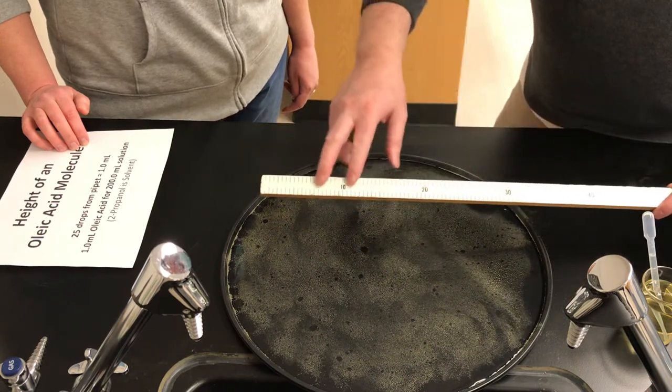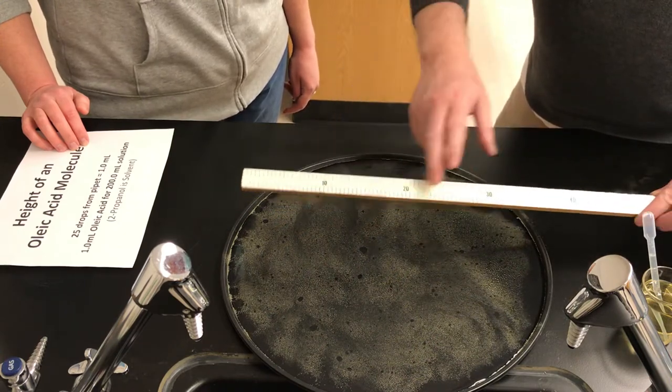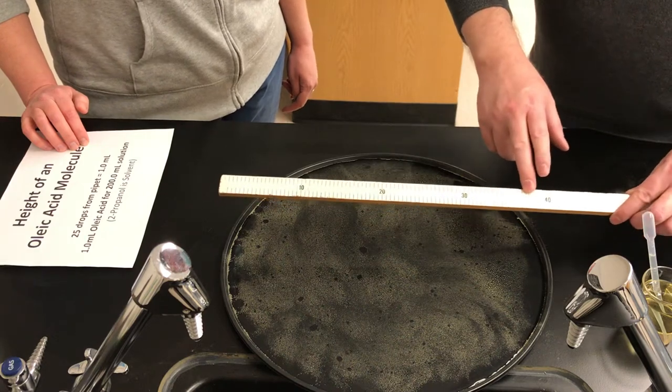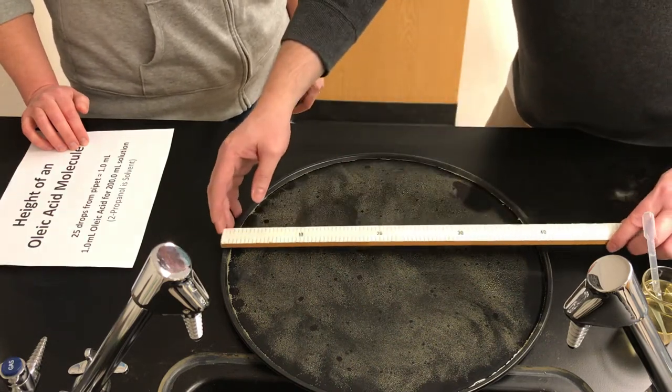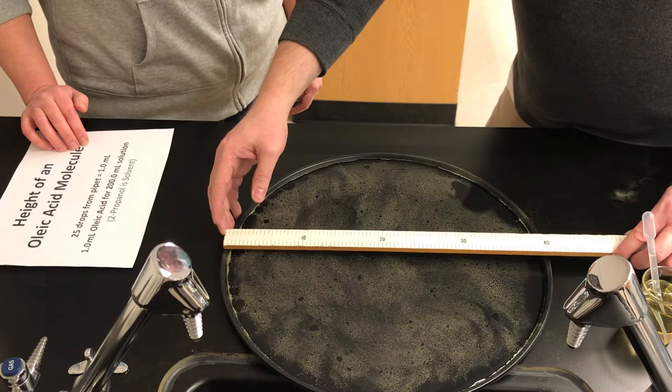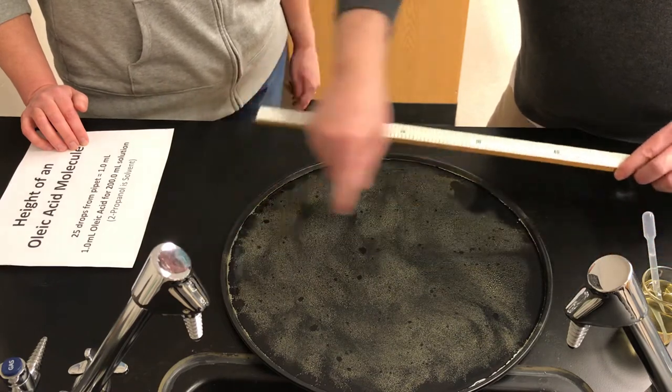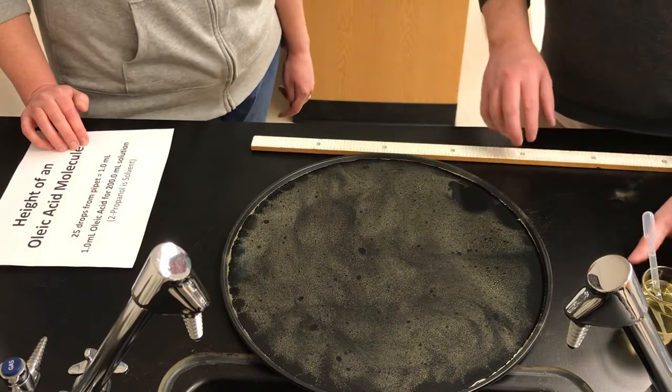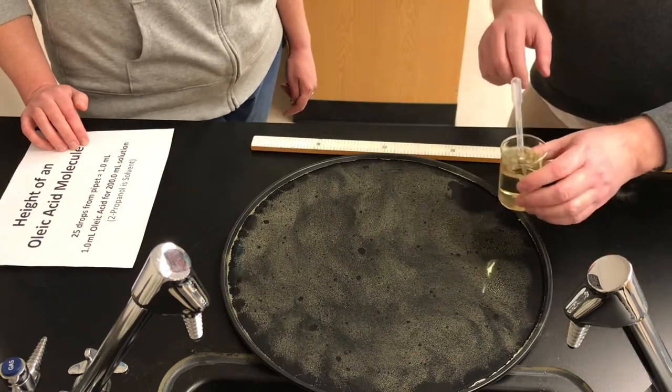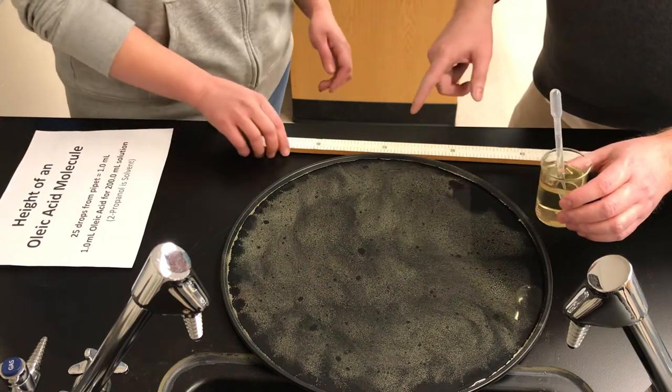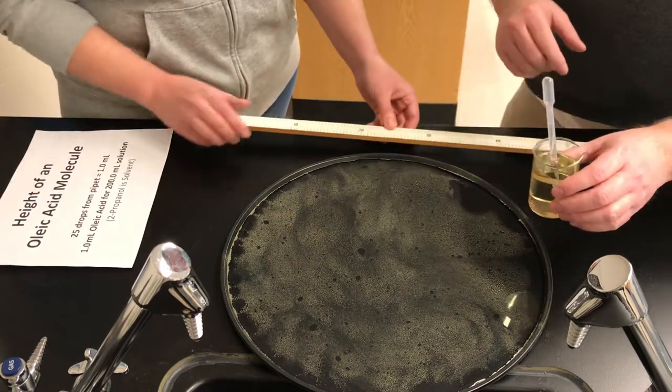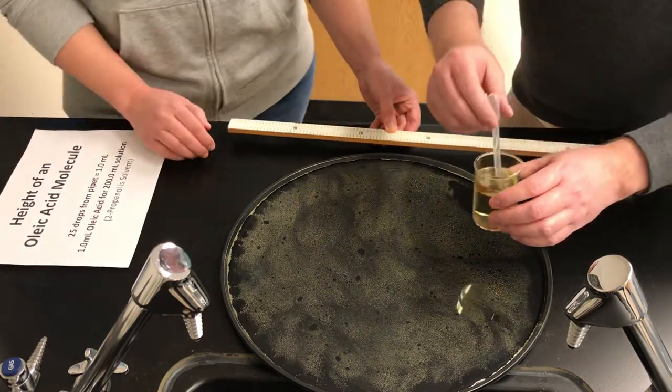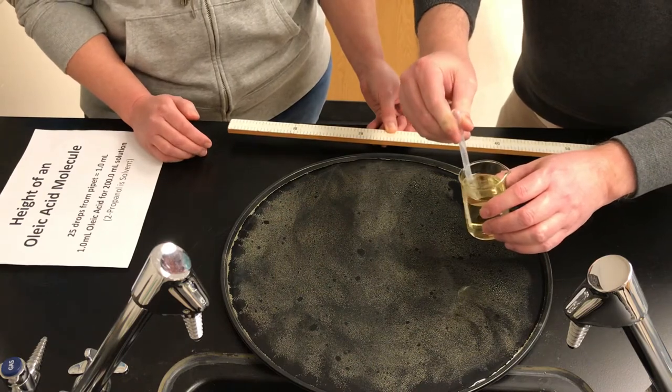So we're going to be using a meter stick. This meter stick is very visible, I think, in the video, the numbers and the scale. It's measured in centimeters. So 10, 20, 30, 40 centimeters, right? So the entire pie plate has a diameter of about 40 centimeters. We're going to be measuring the diameter of the oil slick itself. So I'll add the one drop of the oleic acid mixture. Ms. Watts will then position the meter stick and I'll let you know what the measurement is in the video.